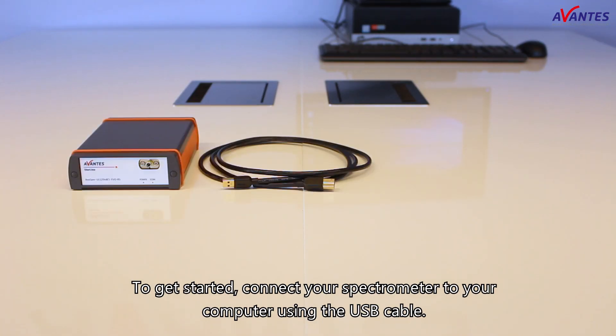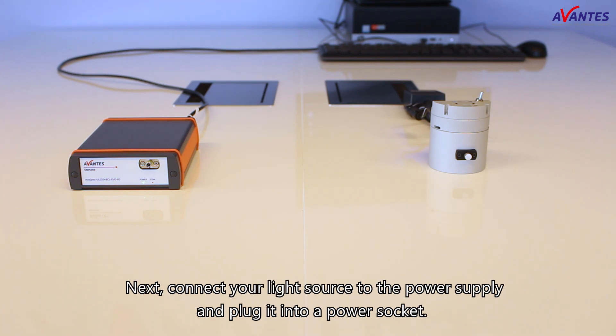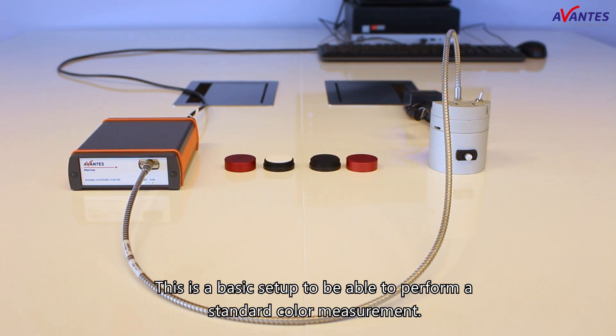To get started, connect your spectrometer to your computer using the USB cable. Next, connect your light source to the power supply and plug it into a power socket. Take your fiber optic cable and connect one end to the light source and one end to the spectrometer. This is a basic setup to be able to perform a standard color measurement.